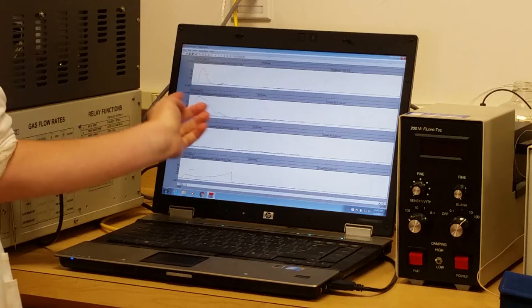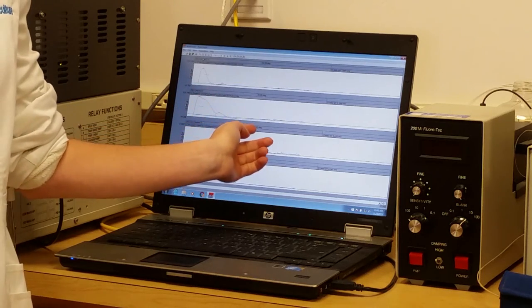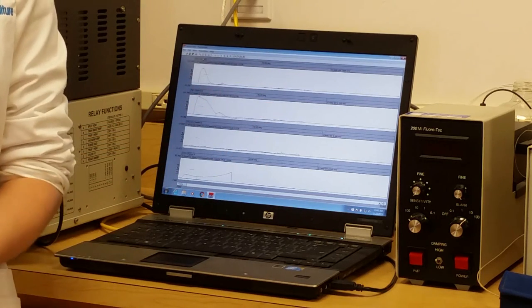Not on this one, but occasionally you'll get long, broad peaks. It's kind of confusing what this means. However, luckily, we have John Meller here, a production manager of Buck Scientific. Hello. Hi, John. Thank you for being here. What does it mean exactly when we get long, broad peaks in a scan?